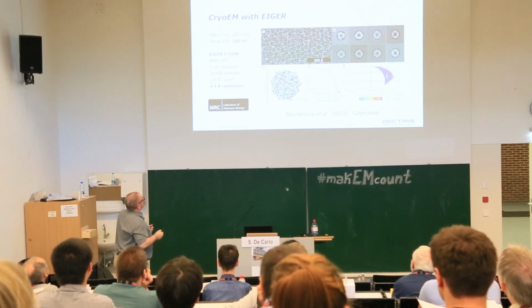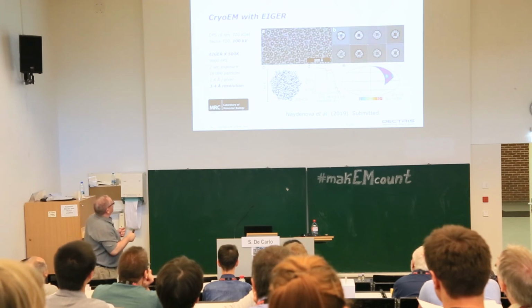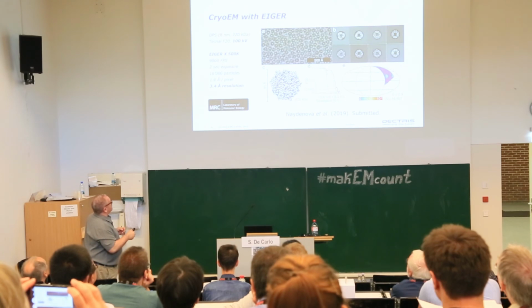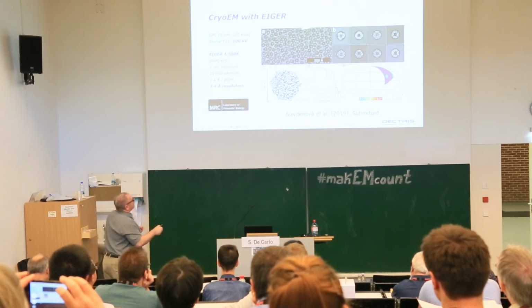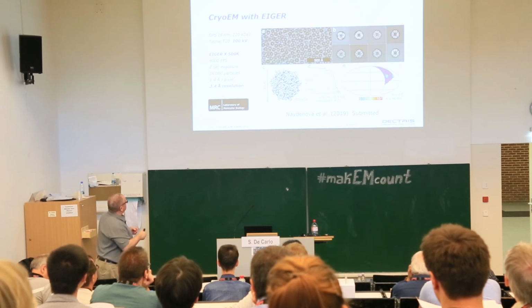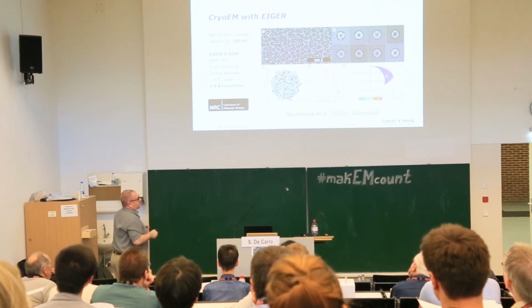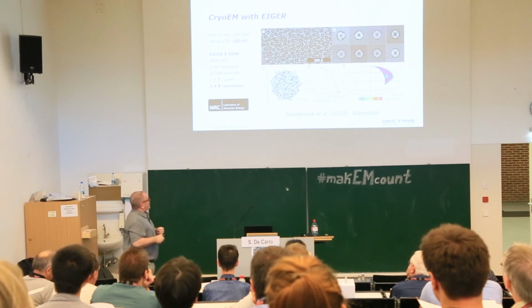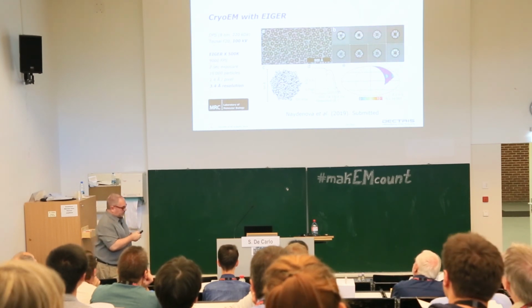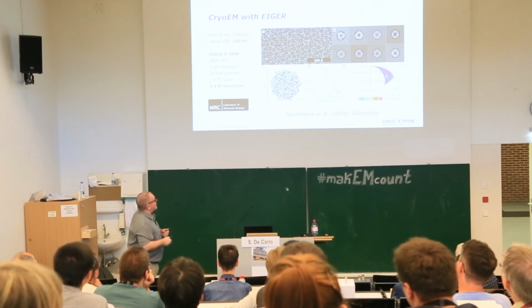But one of the interesting results, and this is maybe a response to the poll that we put on Twitter, was one of the smallest molecules they analyzed. This is DPS, a DNA binding protein from starved cells. It's only 8 nanometers in diameter, about 220 kilodaltons. You see here a field of view with the reverse contrast, for those of you who are used to looking at cryo-EM images. And here, with 17,000 particles and a 1.4 angstrom per pixel sampling, they reached a 3.4 angstrom resolution, which was a very pleasing result, because I was not expecting anything better than 5 for 100 kV and such a small particle. So these are very encouraging results, and this is the paper I mentioned, which should appear very soon.